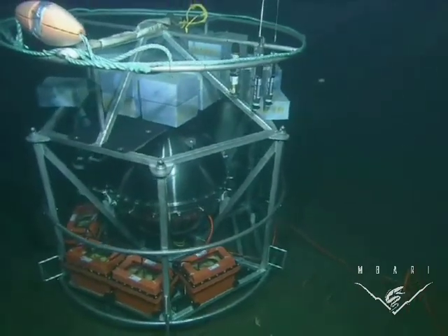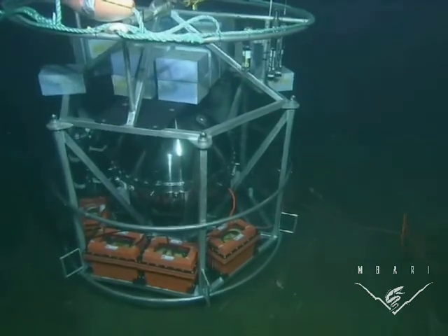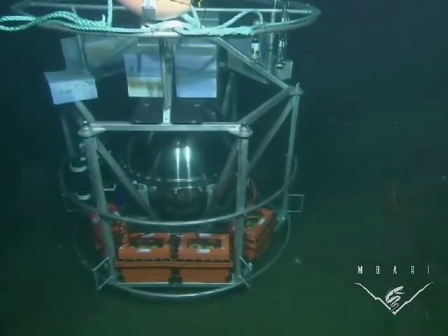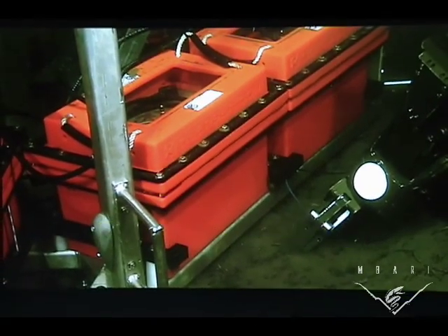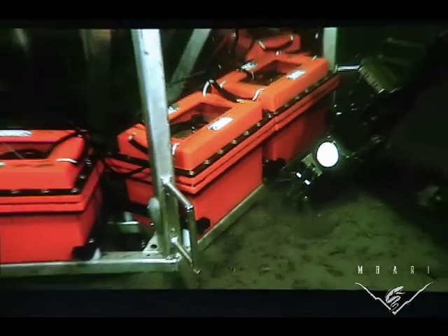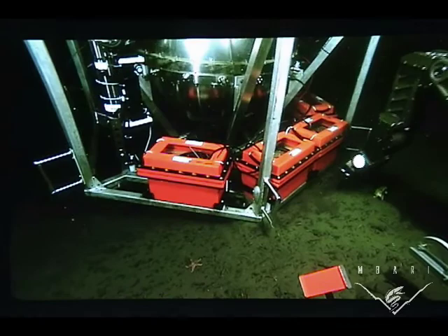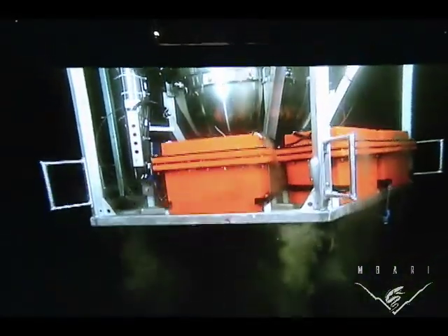In this dive, the ESP remained on the bottom for about three days. I think it ran five samples looking for different microorganisms down there. Here you see the arm of the remotely operated vehicle pulling a little rope that releases a drop weight. When that 250-pound drop weight is released, suddenly the deep ESP becomes positively buoyant and floats to the surface.